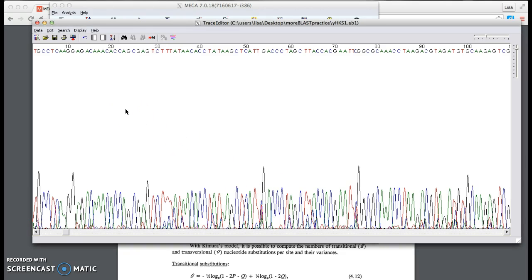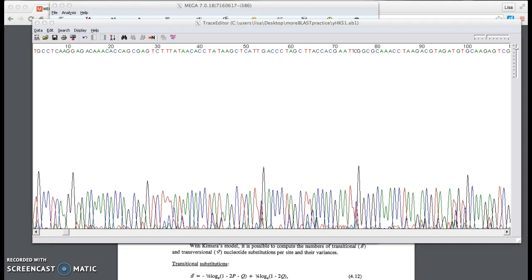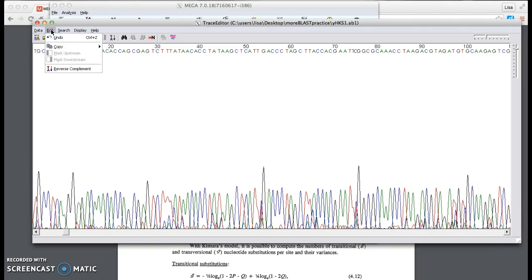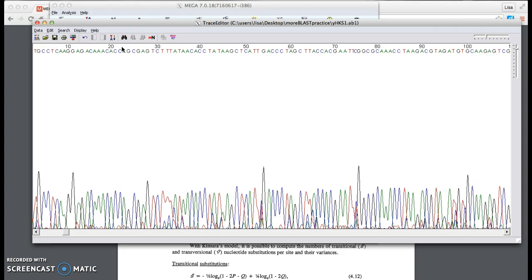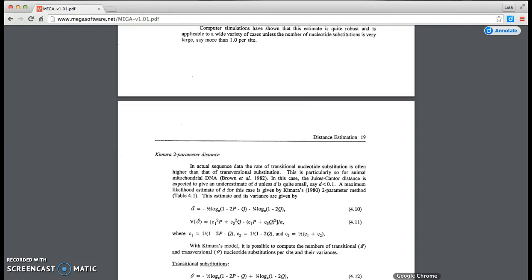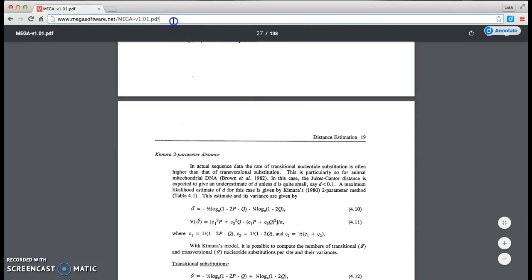So now I have a file. And the next thing I want to figure out is how I can put that into the blast site to be able to figure out what organism I'm looking at. Maybe I have a whole new species. To be able to put it into the blast site, I need to choose Edit. I'm going to copy this in the FASTA format. Control B from here will do the same thing. Now I just choose a browser and I'm pulling up Google Chrome.